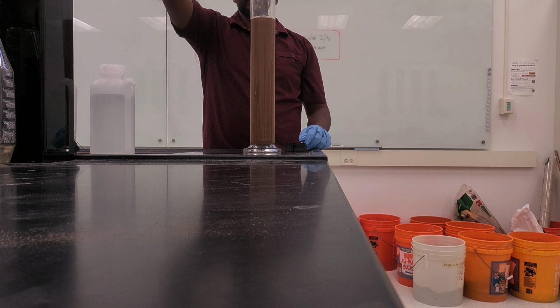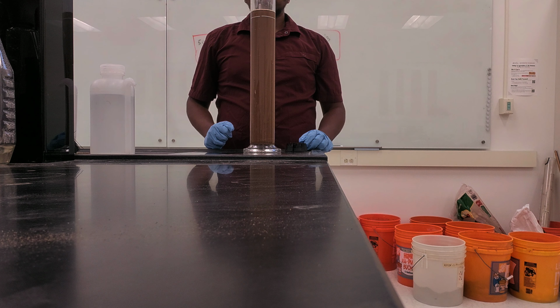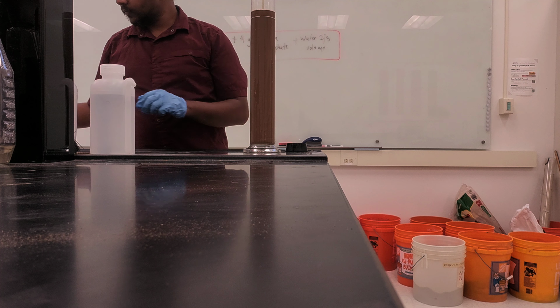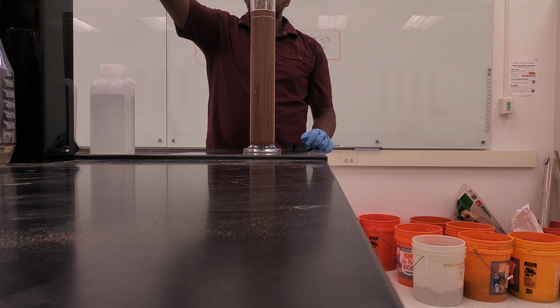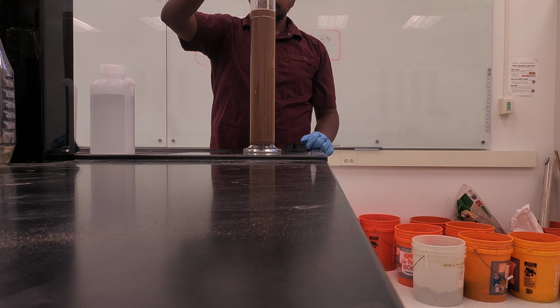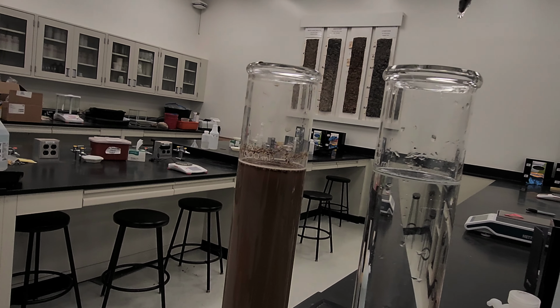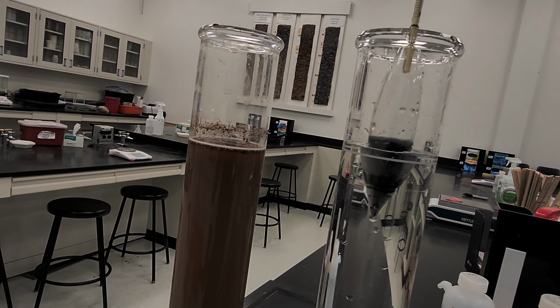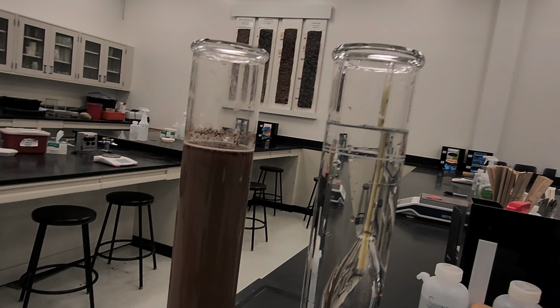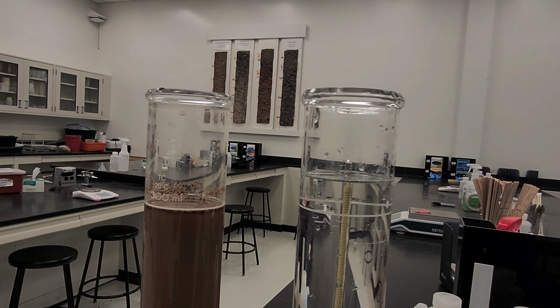After 40 seconds. Allow the cylinder to be undisturbed for 2 hours following the last 40-second reading. There needs to be a blank hydrometer reading as well. The blank hydrometer reading will not have soil sample on it.